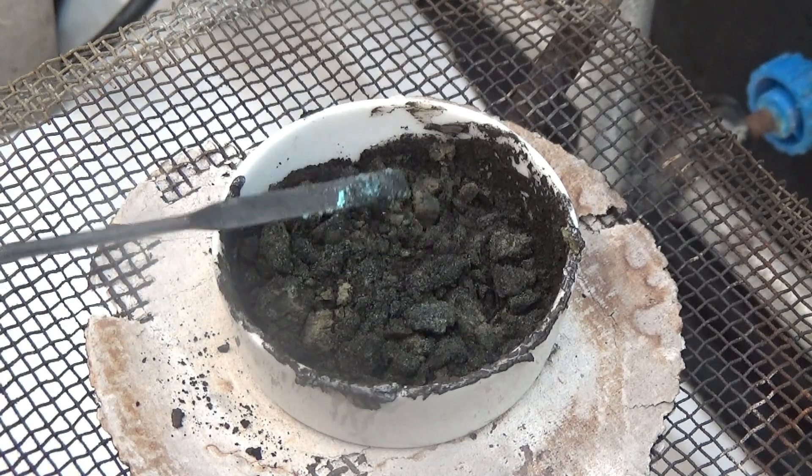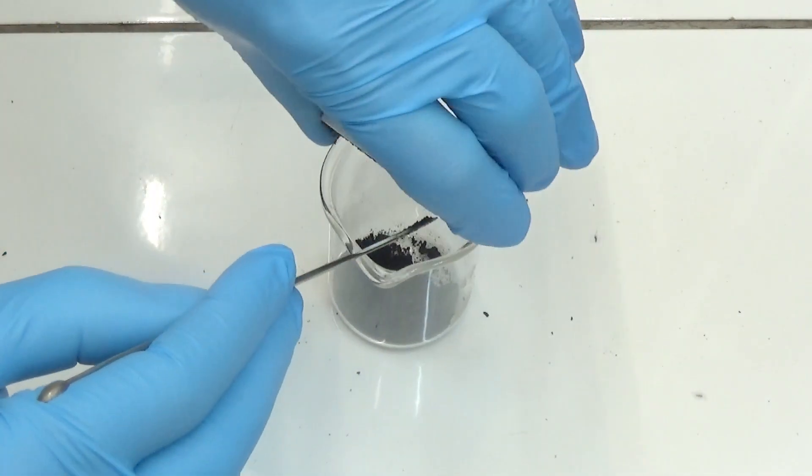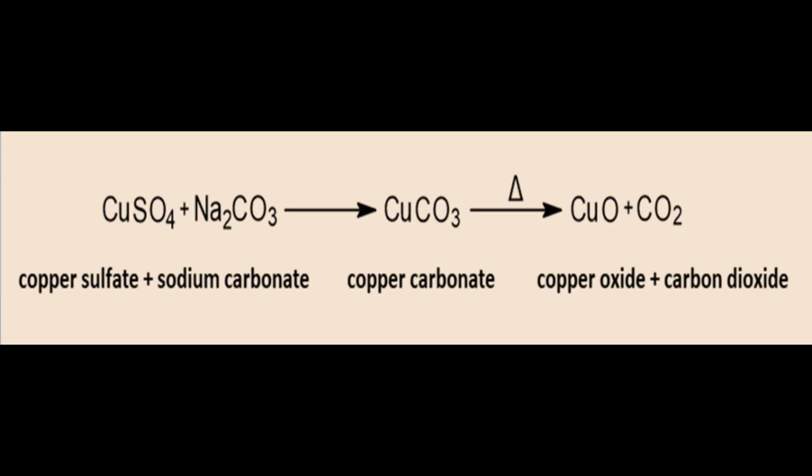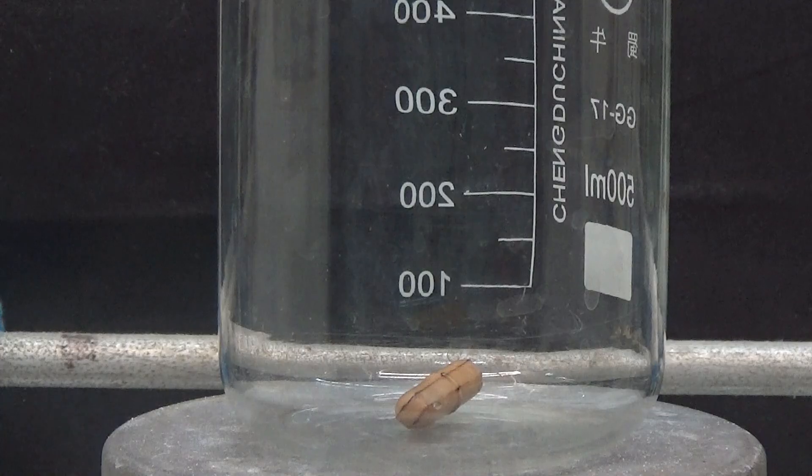The first step is to obtain the catalyst. The catalyst used in this synthesis will be copper oxide. In my warehouse, I do not have copper oxide and I had copper sulfate pentahydrate that converted into copper carbonate and heated to obtain the oxide with carbon dioxide release. First step is to prepare the copper carbonate.